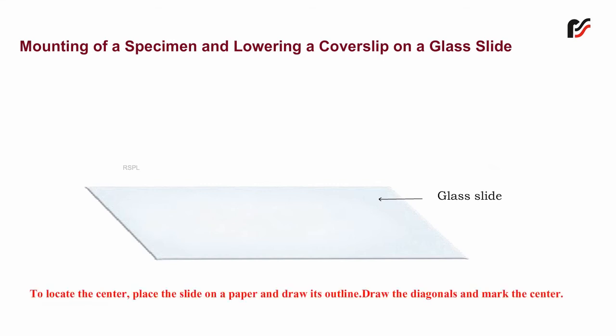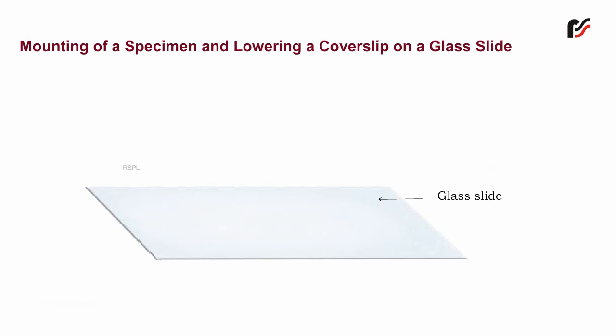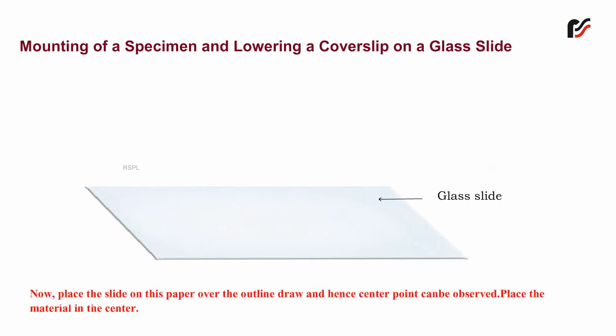To locate the center of the slide, place the slide on a paper and draw its outline. Draw the diagonals and mark the center. Now place the slide on this paper over the outline drawn, and hence the center point can be observed.